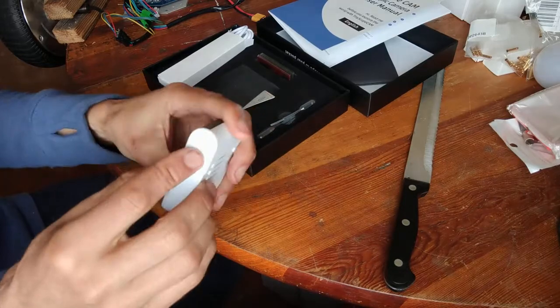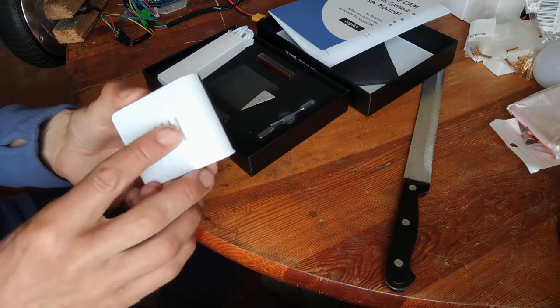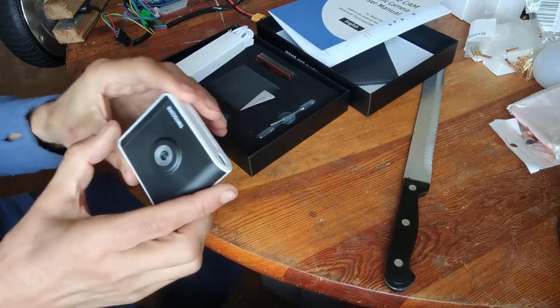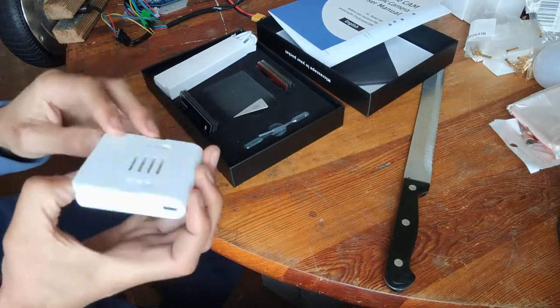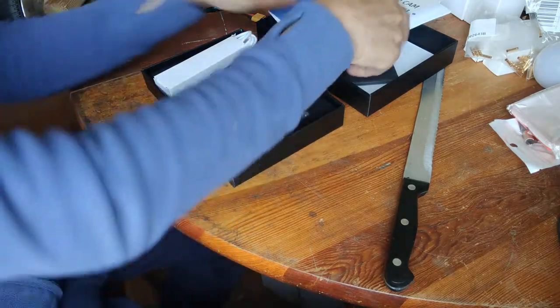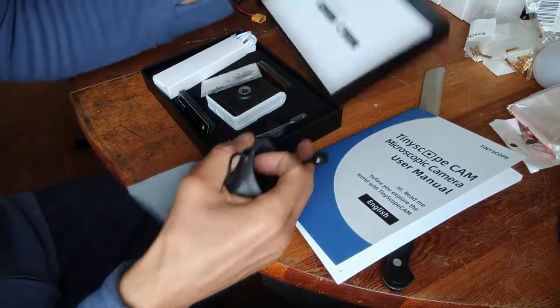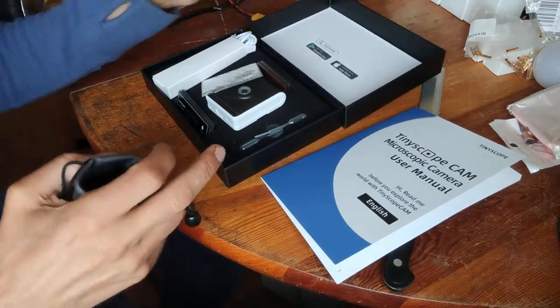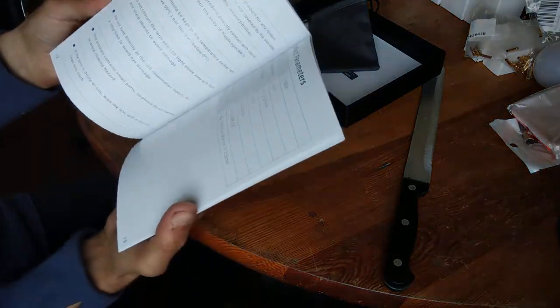It looks very tough — hard plastic, about two to three millimeters thick, doesn't look like it'll break easily. I'm not sure yet where the dark field mode works, but there might be LEDs inside. For the travel box, it's nice that the app is on the Play Store and not a manual download from some unknown Chinese manufacturer.